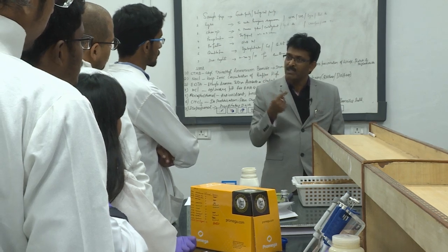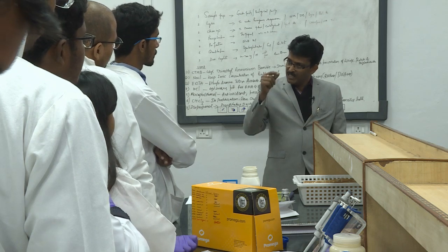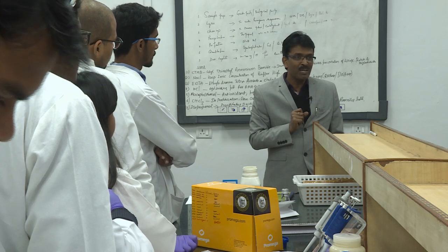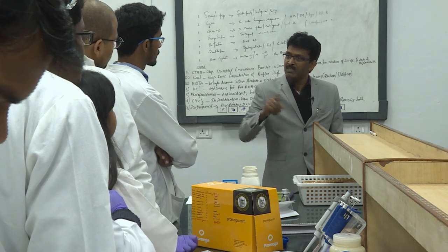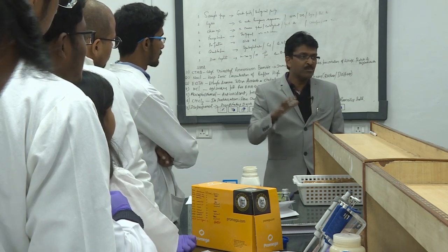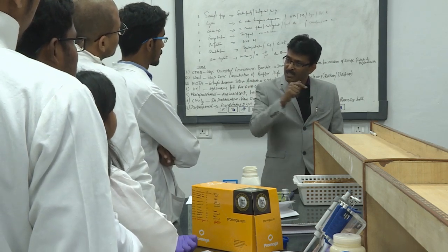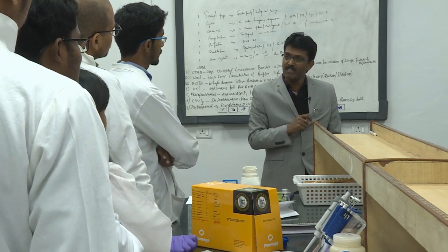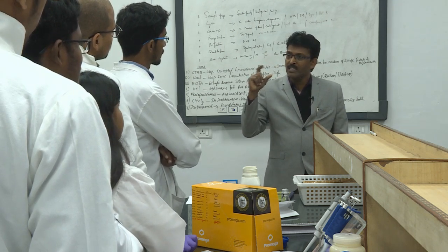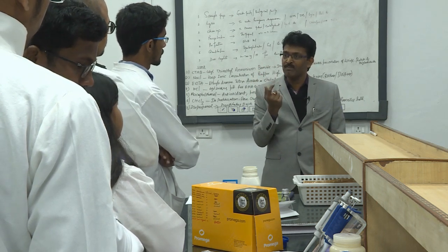All the filters are picked using sterile forceps and put in an Eppendorf tube, right? And that Eppendorf tube is subjected to vacuum drying for 1 hour. Okay? And this you repeat on the 2nd day and 3rd day, right? On the 4th day, you take the entire setup to the flow cabinet and slowly release the vacuum without spoiling the sample inside, and take out the tube, and you will see the dry filters which are coated by the fungal spores, right?